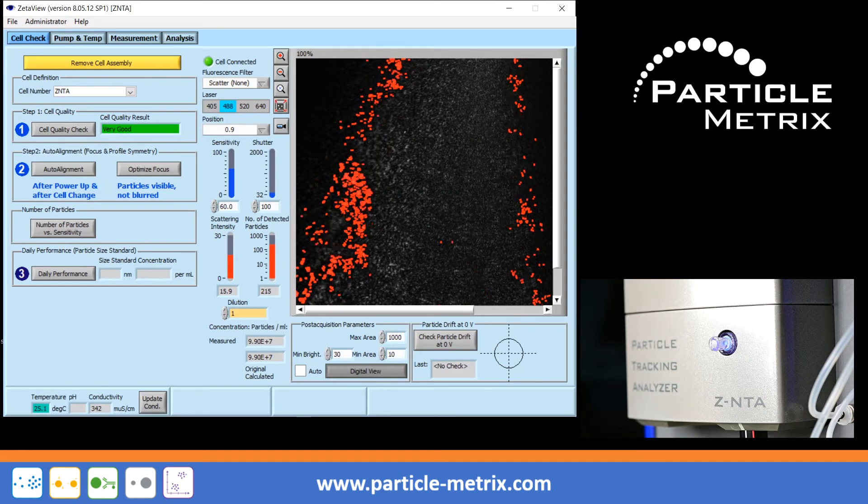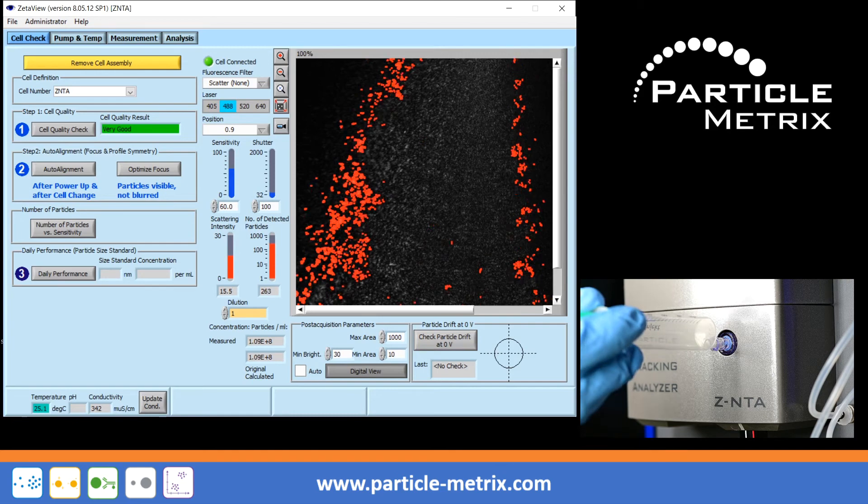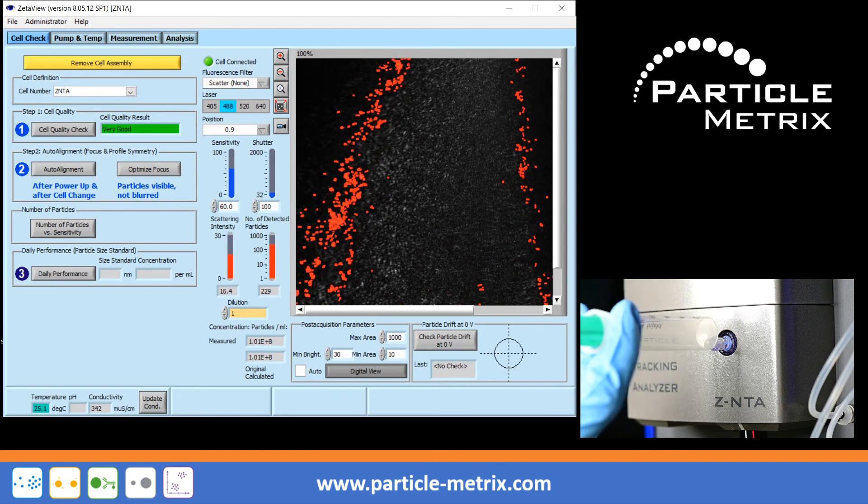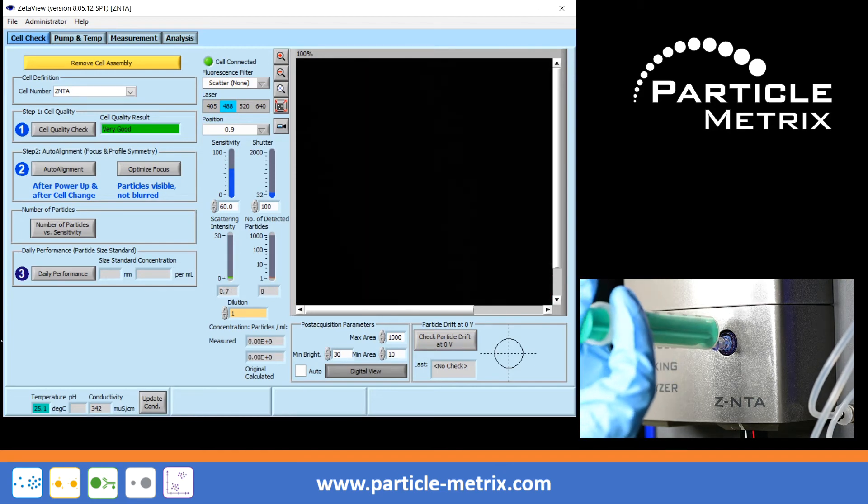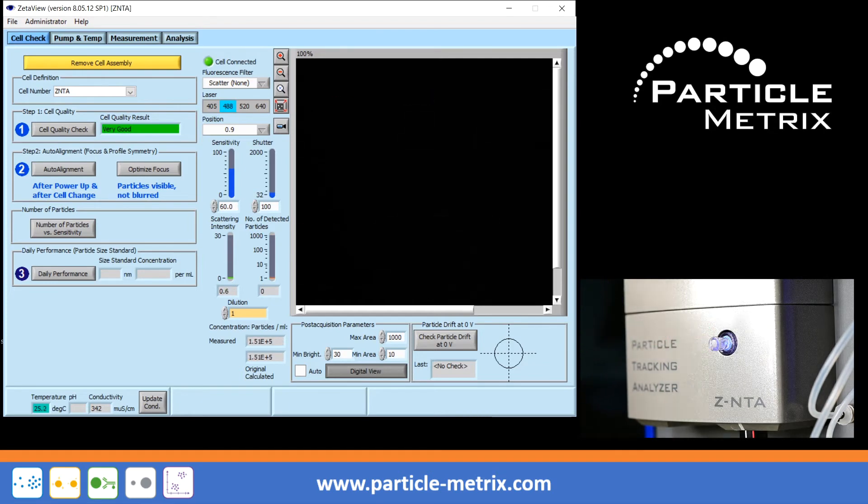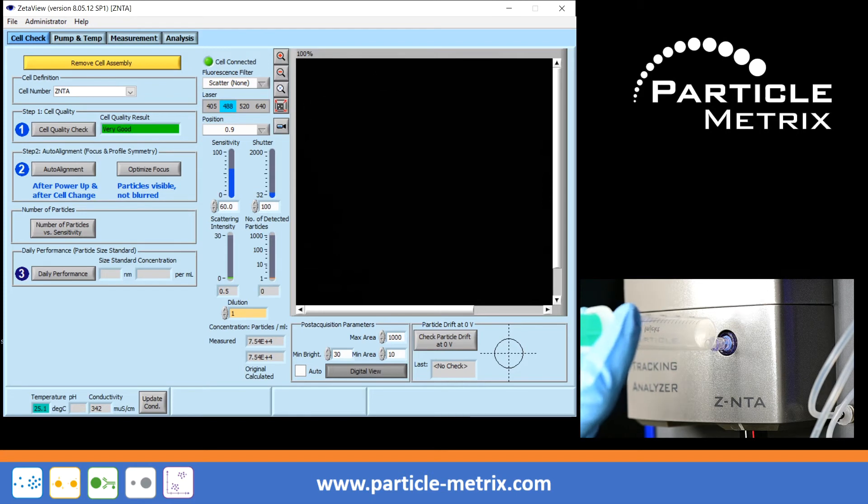However, if the air bubble extends over all measuring positions and it cannot be removed, remove the sample from the fluidic system by first injecting 10-20 ml of air with an empty syringe. Unfortunately, you will lose the sample in this way.